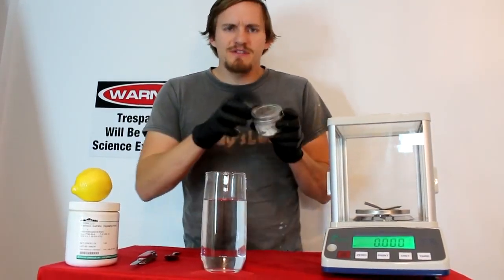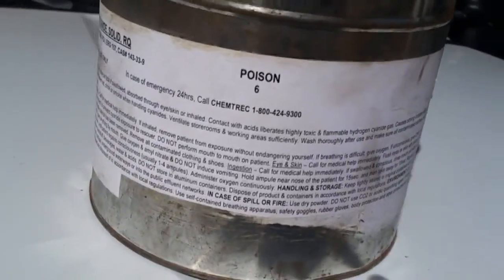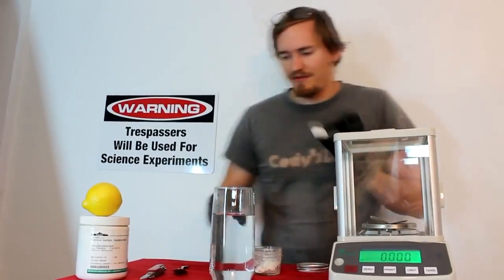Welcome back to Cody's Lab. I have here some sodium cyanide — a very useful chemical in many processes such as mining. In fact, that's what these pellets were originally made for.